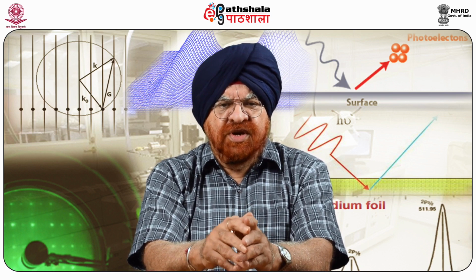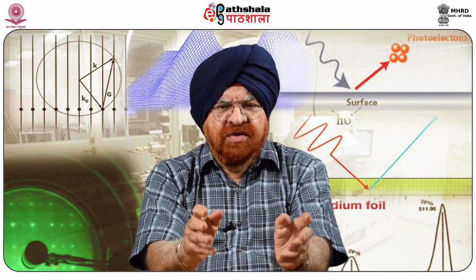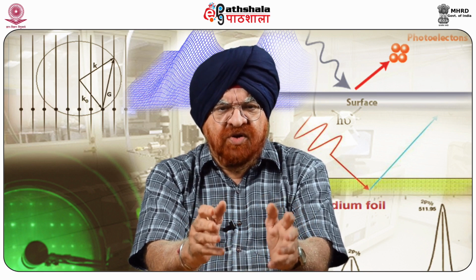An uncoiling ensues, and the force required jumps, indicating various stages of uncoiling: division into bundles, bundle division into domains of crystalline proteins held together by van der Waals forces, and linearization of the protein upon overcoming the minor bonding. Information on the internal structure of these complex proteins, as well as a better understanding of the constituent interactions, is provided by this method.